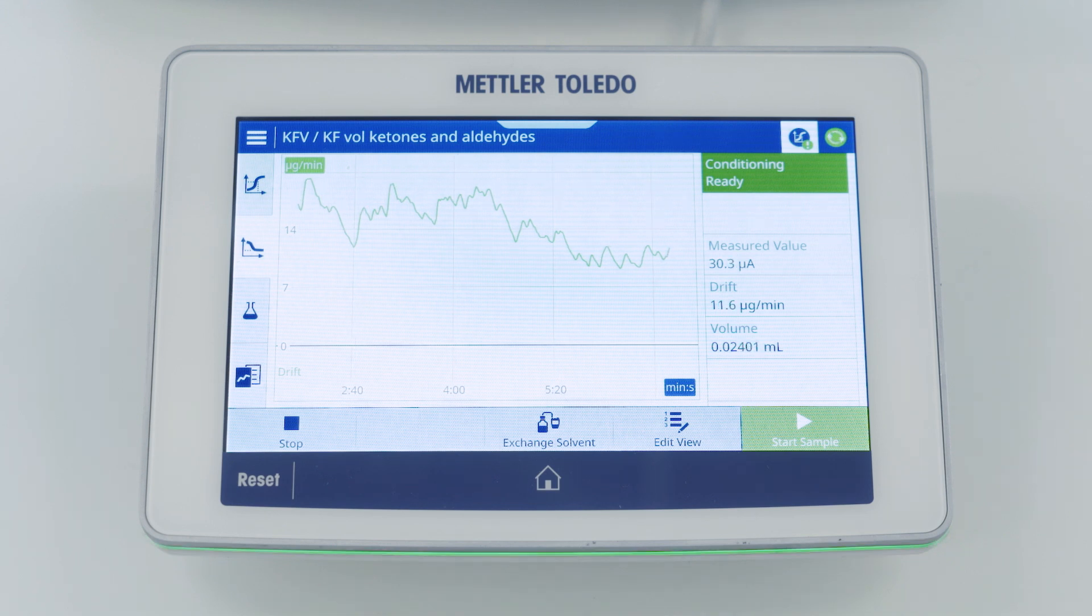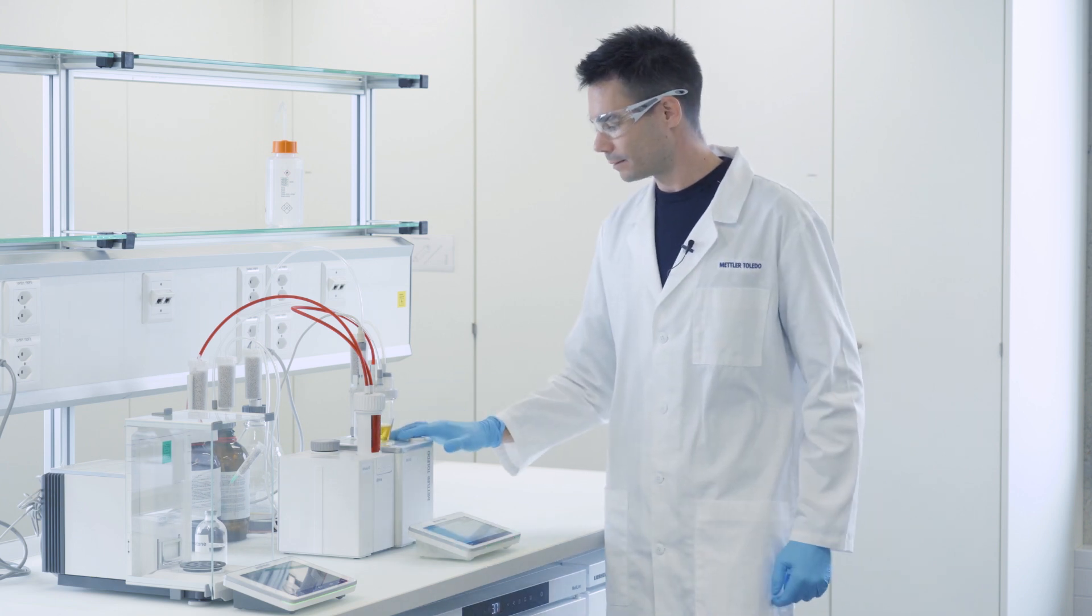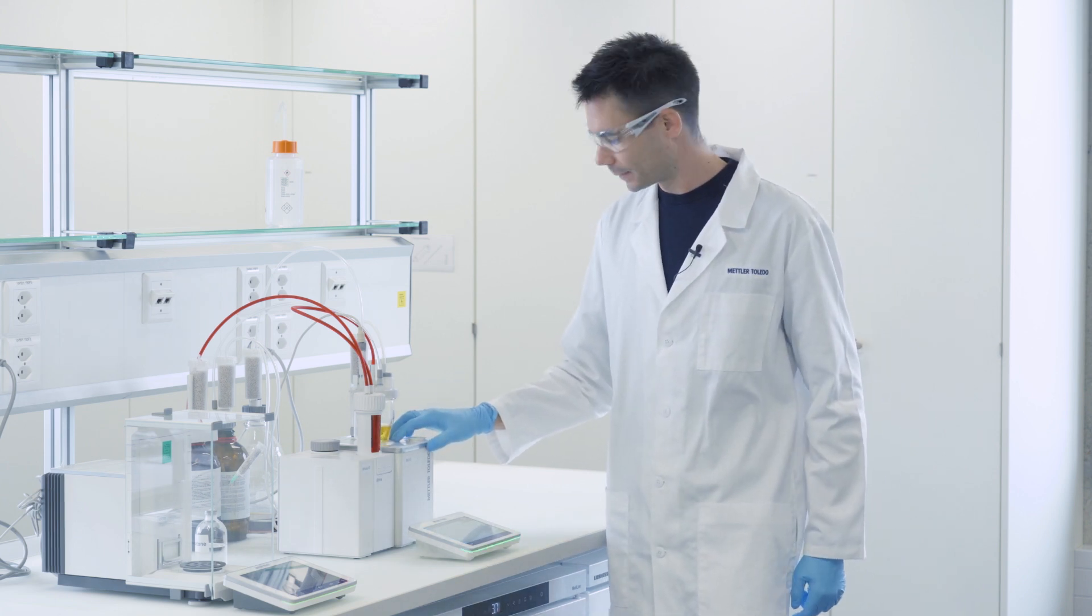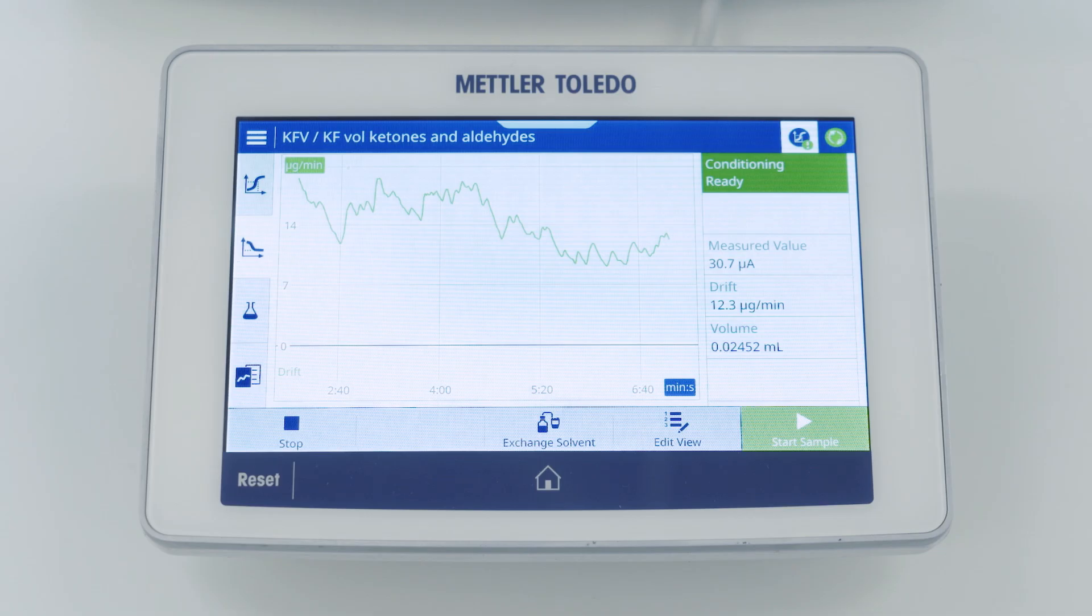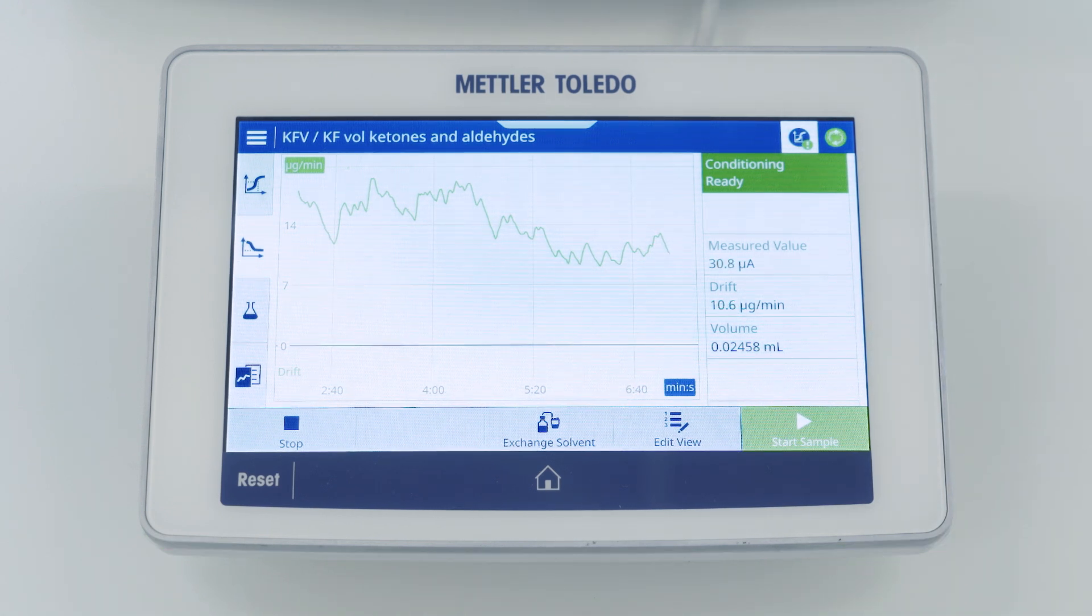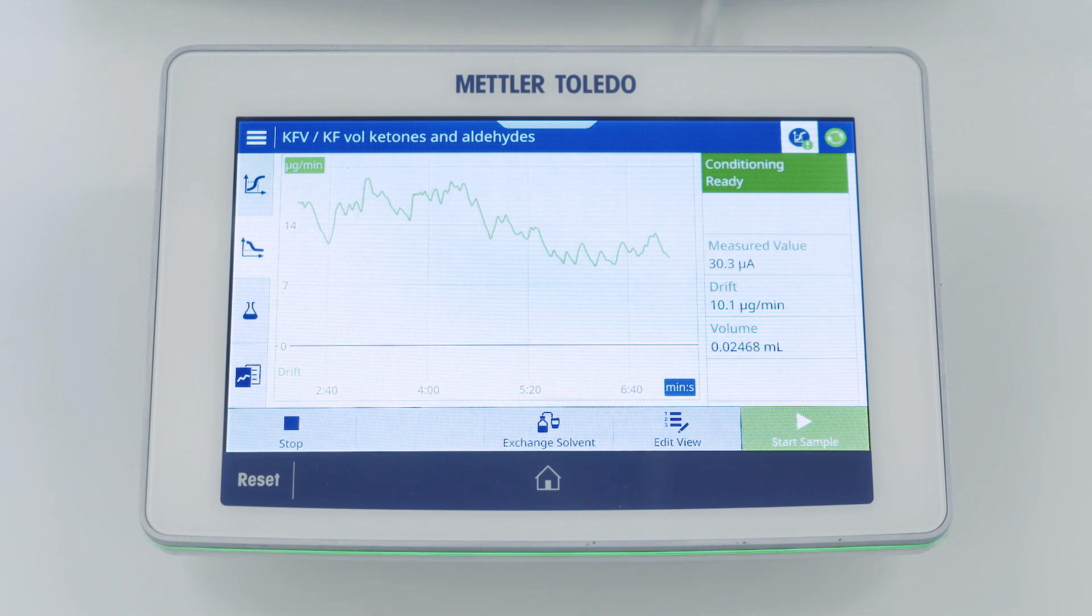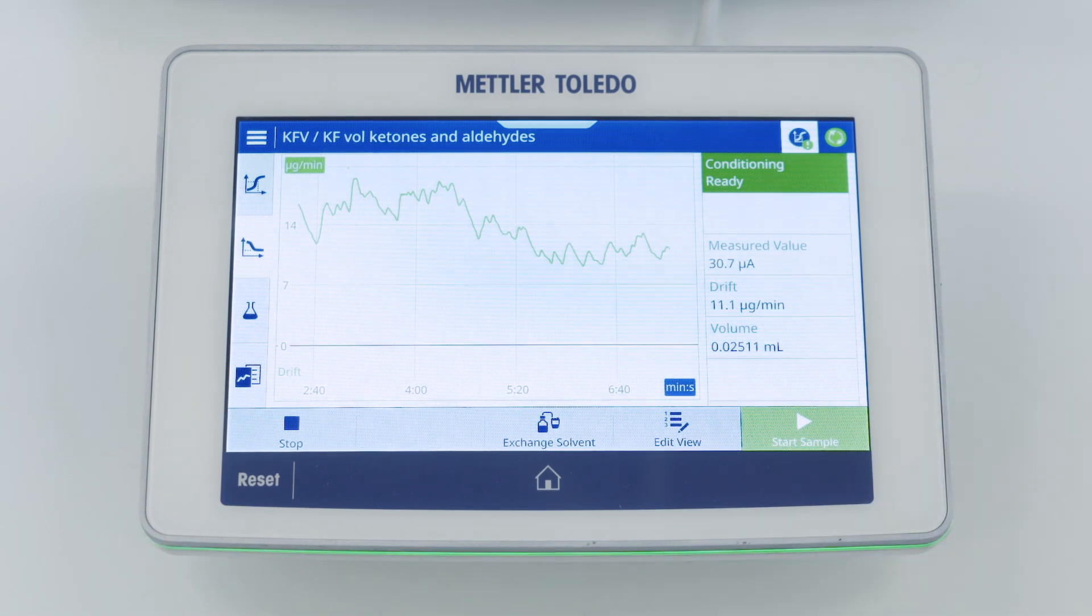Now the first thing that the titrator has to do when we start the method is making sure that the titration cell is water free. To do this we first do a so-called conditioning. In the conditioning we check that the drift value, which shows how much water is getting into the cell per amount of time, is as low and stable as possible. If the titrator finds that the drift is low and stable enough we can start the sample, which is the case now because the start sample button is lighted green.